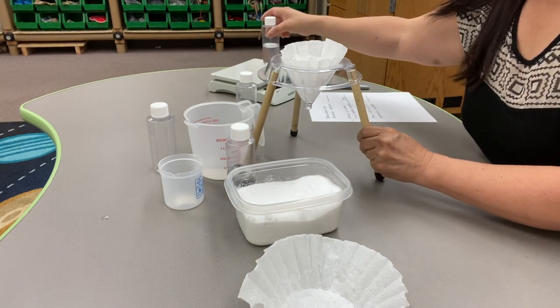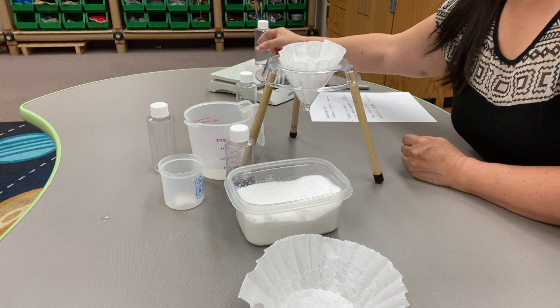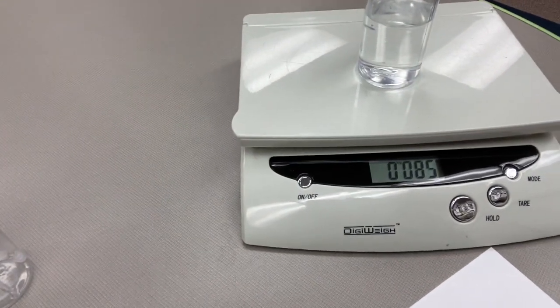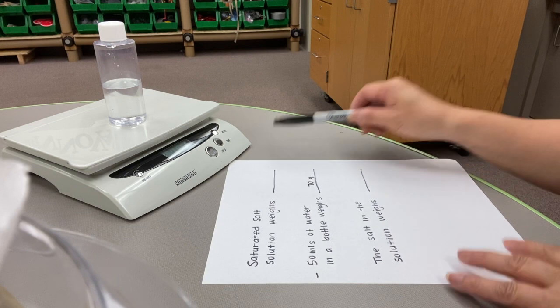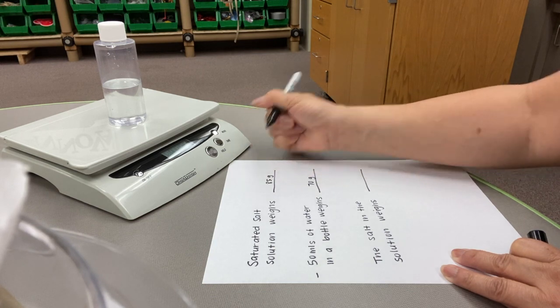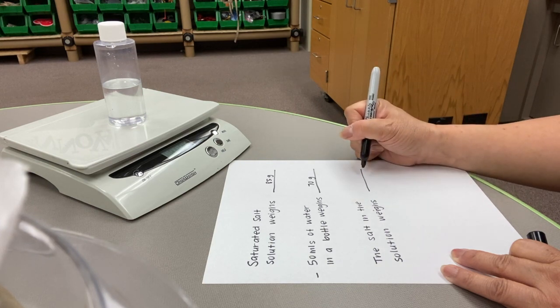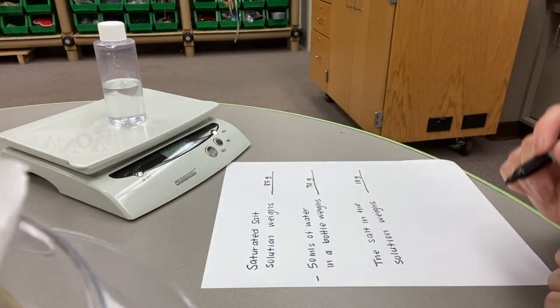And if we weigh this on our scale, what we get is 85 grams. I'm going to put that on my paper. The saturated salt solution weighs 85 grams, minus the 50 mLs of water and the bottle, so the salt in the solution weighs 15 grams. It took 15 grams of salt to saturate that solution.